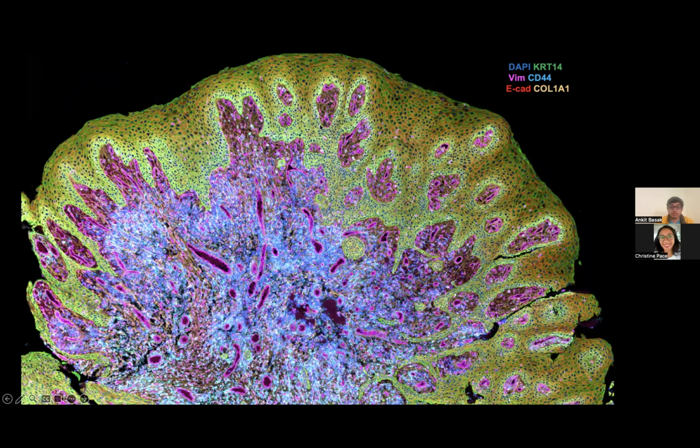One of the things that is incredibly stark and interesting to us is that these neon patches always appear in regions around fibroblast niches. And when the epithelium is far away from the fibroblast regions, it becomes more differentiated, so you do not see these neon patches anymore.